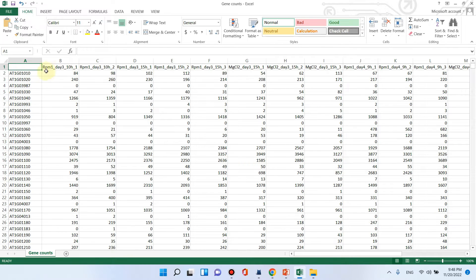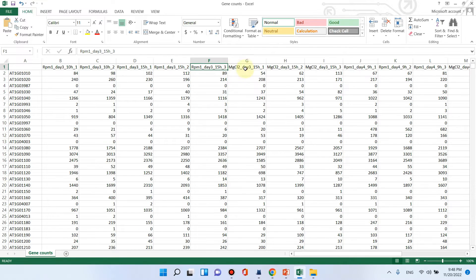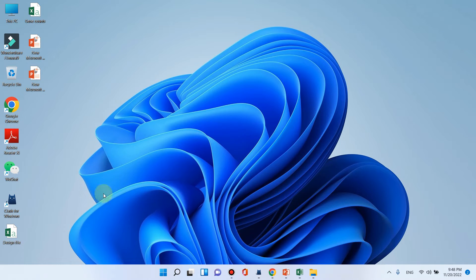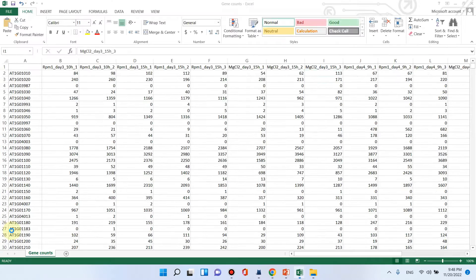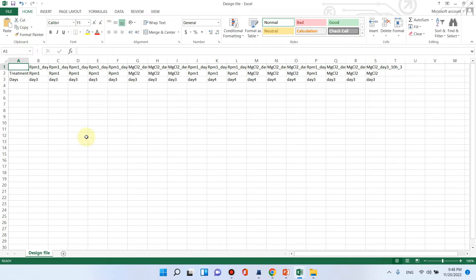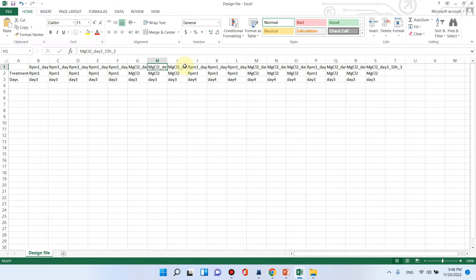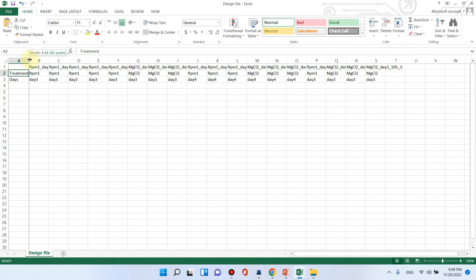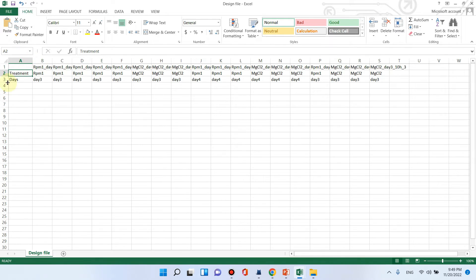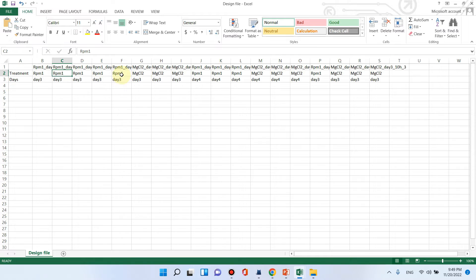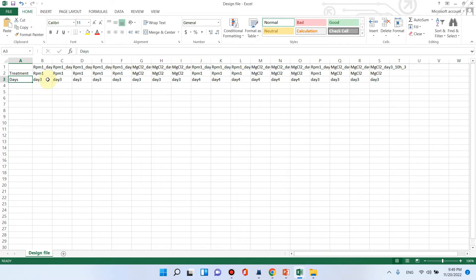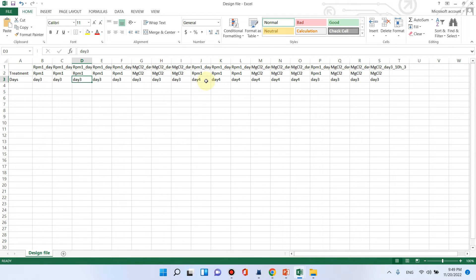Now let me show you how we can prepare our design file. All these names should be copied and pasted to the design file. I have already prepared that design file. You can see there are all those 18 treatment names which I have copied, and I have mentioned what was the treatment and what were the number of days. I have written RPM RPM, this was the first treatment. Using MgCl2, I have separated MgCl2 and RPM as treatments, and I have also mentioned number of days like day three day three day three and here are a few at day four as well.